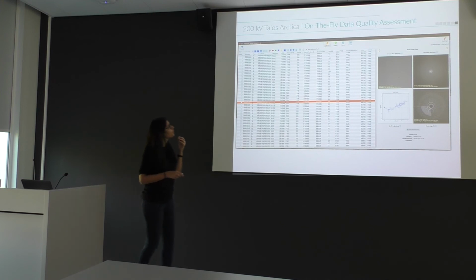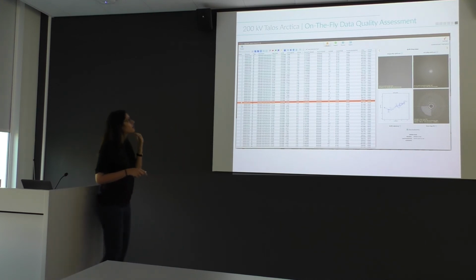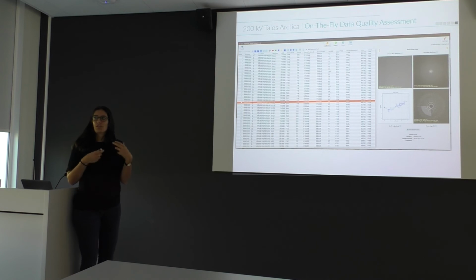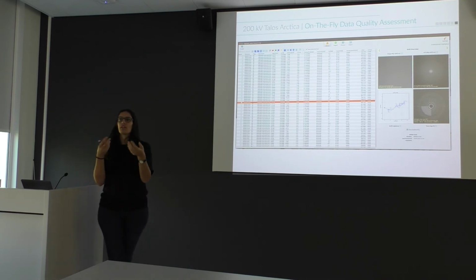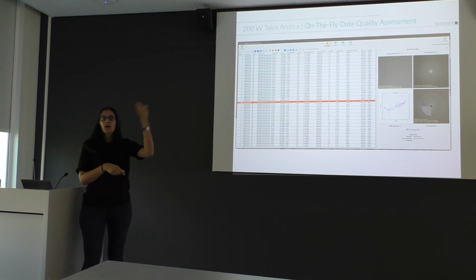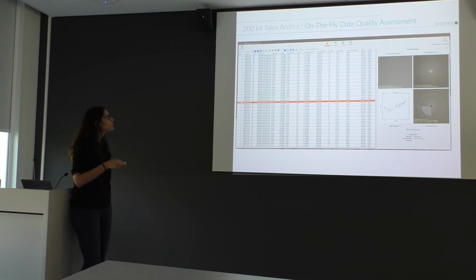My contribution to the setup: I always like to say I lived so many years in Germany, and one thing that I very proudly adopted is trying to be as efficient as possible. So the way we try to do this is we have this ice thickness measurement, we already have our numbers and we kind of know it, but nevertheless we always set it up, start data collection and check on the fly how the images look. And this is where Focus comes into play. There are several different programs you can use to do this. I like Focus, from Henning Stahlberg, because we also liked the whole interface.